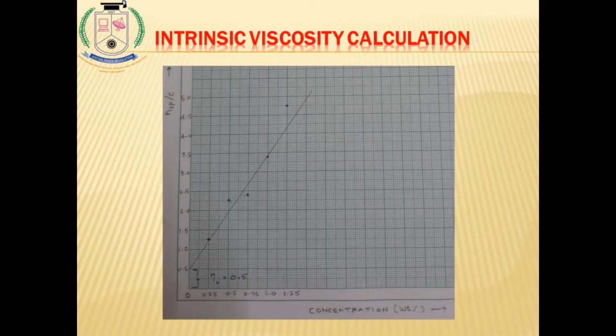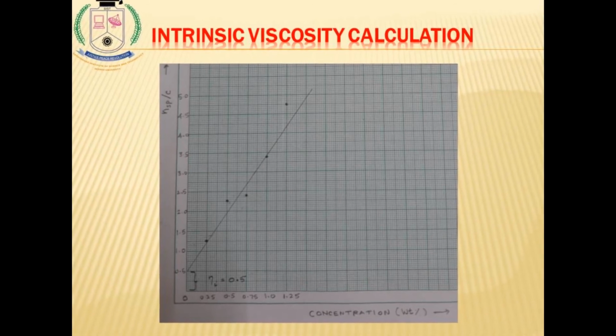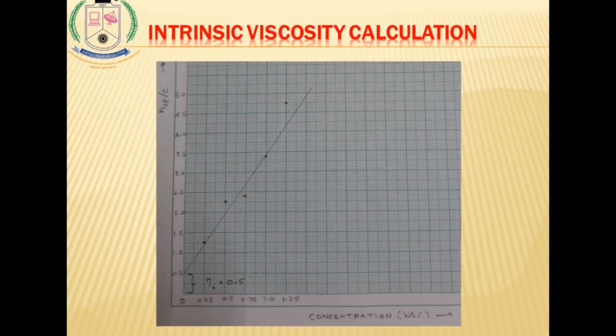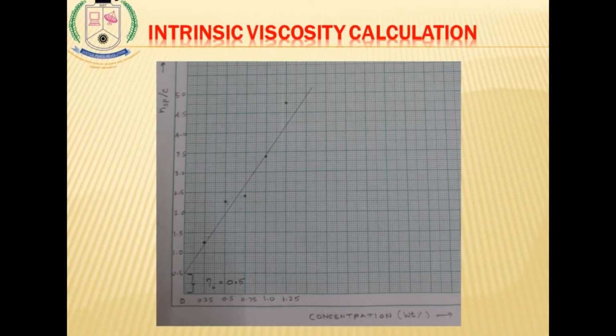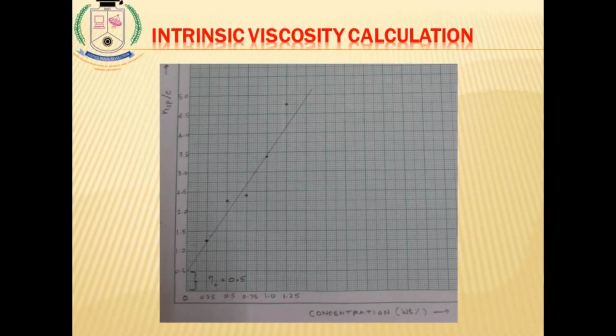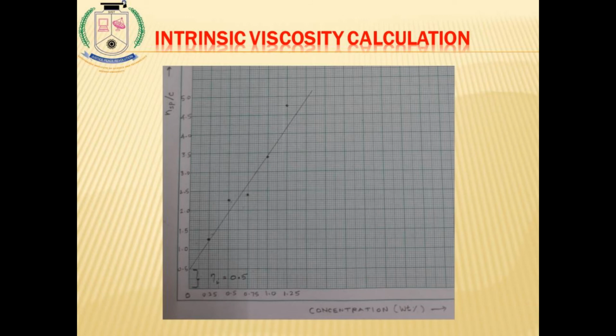If you draw the graph between these two, we get a straight line which intersects the y-axis.